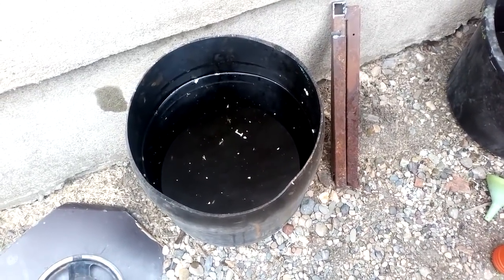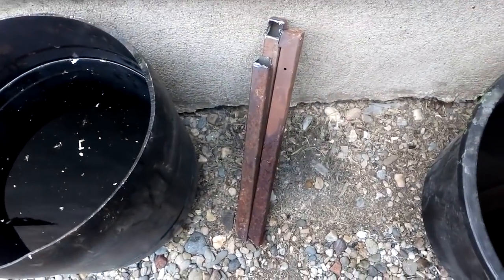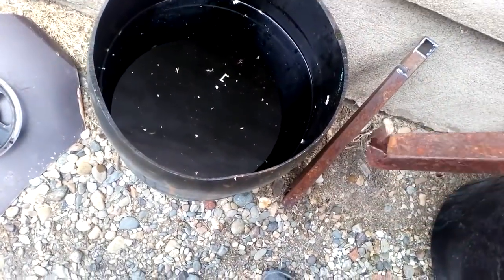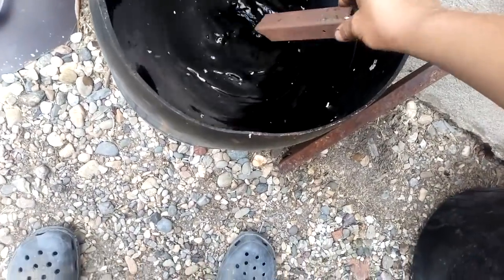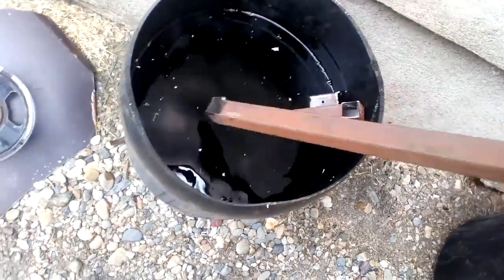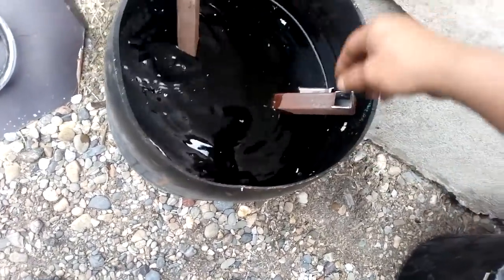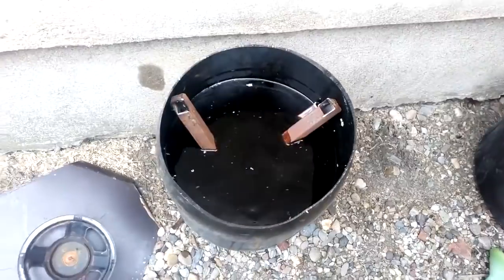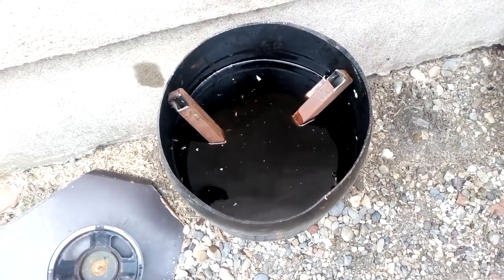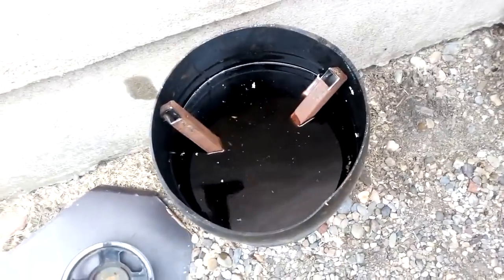The first step is to remove some copper, and for that purpose we have iron pipes. So what we are going to do first is put some pipes inside and leave that for a couple of days. After this, the solution should look like this — all the copper has already been removed using the iron pipe.